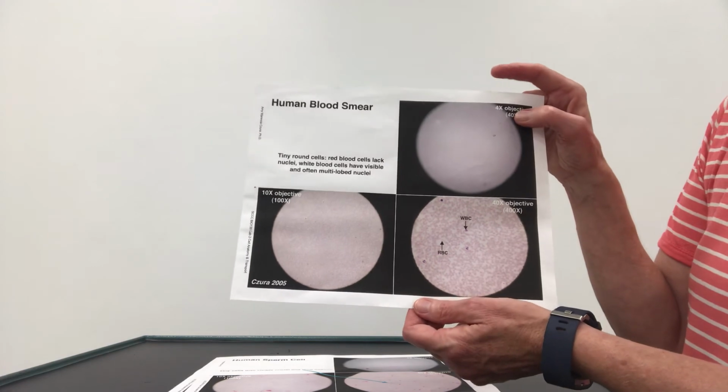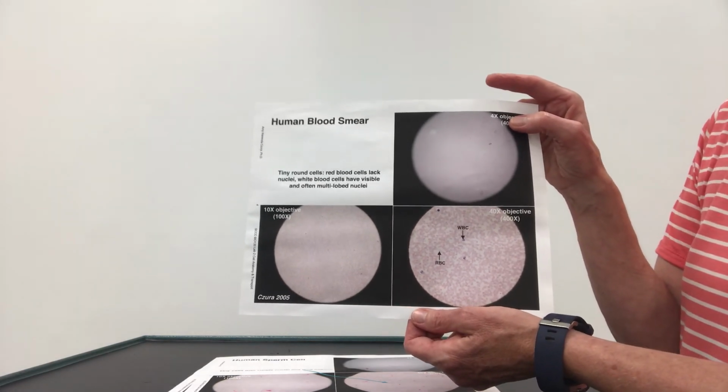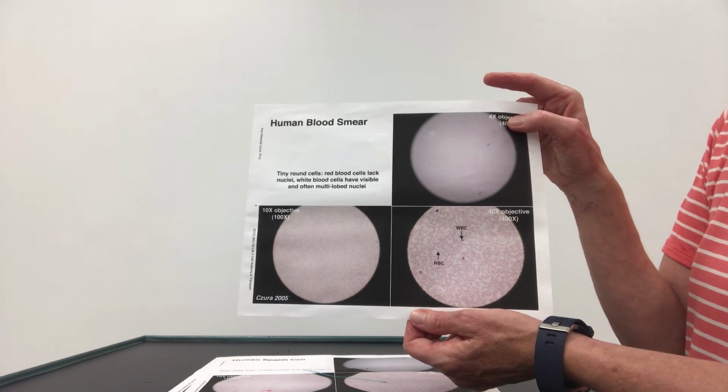Okay. The last slide, again, we're seeing it once more, is the human blood slide, just so you can see. These are extremely tiny, but that's important so that the red blood cells can fit single file into the capillaries so they can drop their oxygen off.